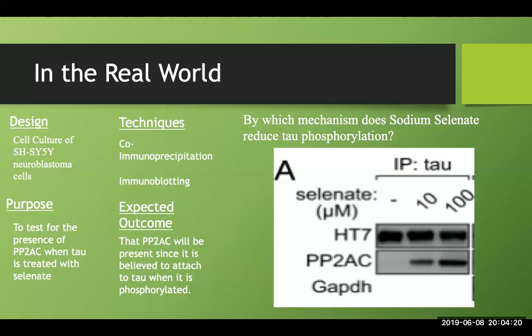Some limitations and strengths to this experiment. One strength is that it gets closer to a treatment to battle the pathogenesis associated with Alzheimer's disease. A strong limitation is that it's not sure to completely stop or eradicate Alzheimer's disease. It just slows it down or fights the phosphorylation. And it didn't target anything with the beta amyloid plaque, which is also a very big deal associated with Alzheimer's disease.